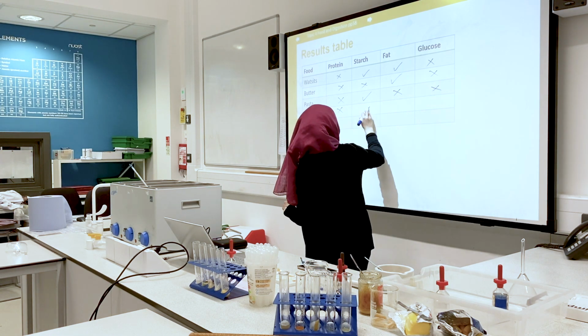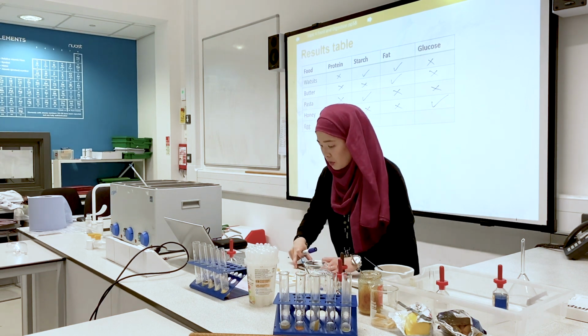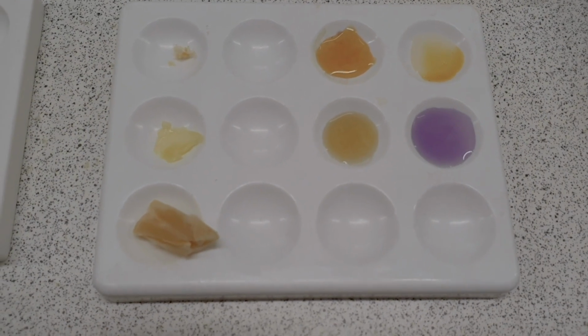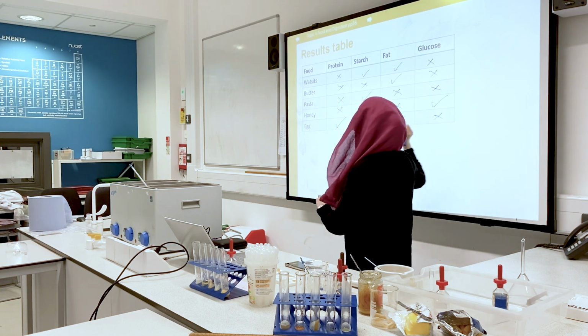Honey, no. Glucose, yes. Protein, yes. We saw the purple colour. Starch, no. Fat, no. Glucose, no.